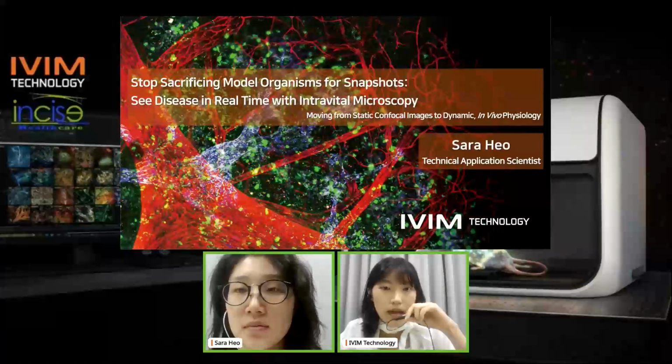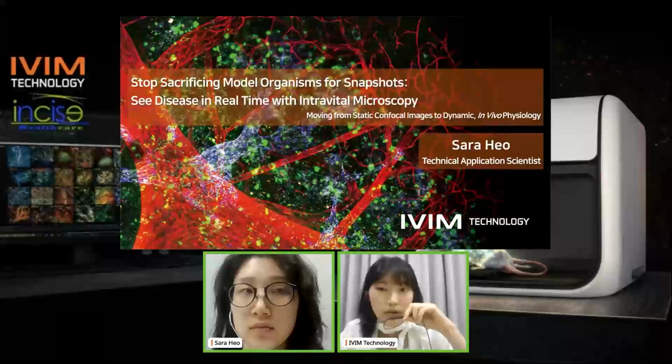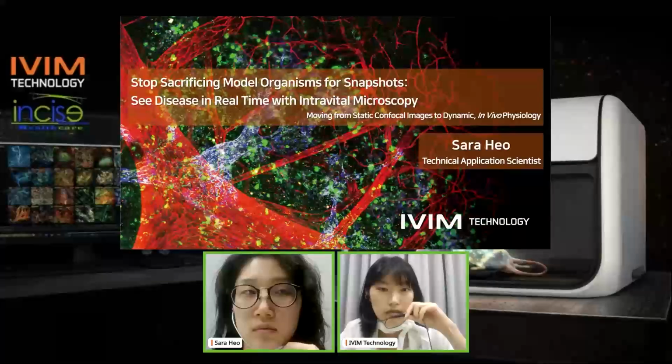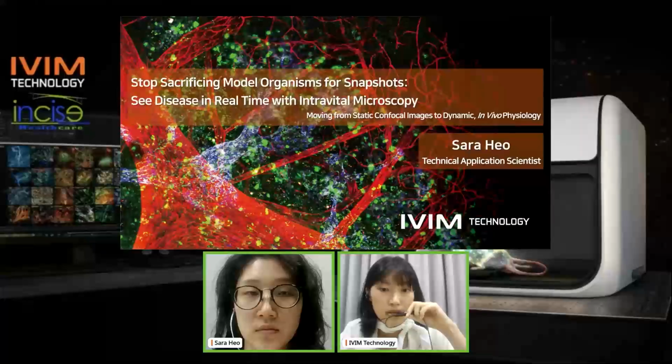This webinar will highlight how intravital microscopy enables researchers to move beyond static snapshots and directly visualize disease progression in living animal models. By capturing cellular and vascular dynamics in real time, longitudinal intravital imaging can provide deeper biological insight while reducing the need for animal sacrifice and improving experimental efficiency.